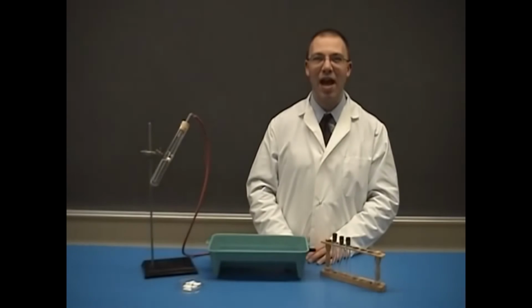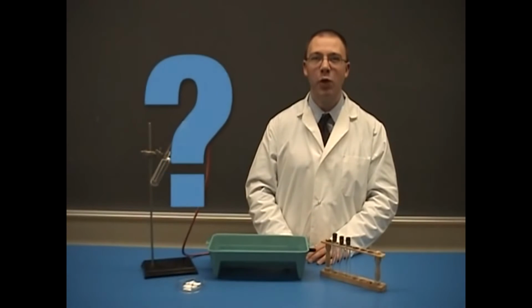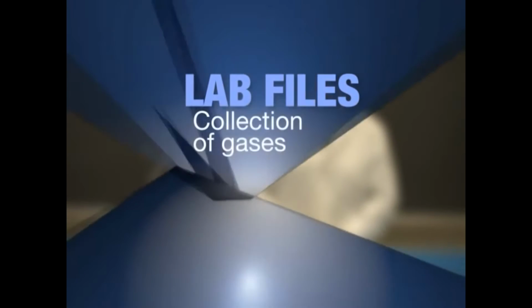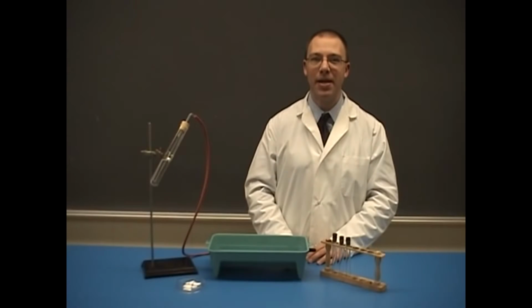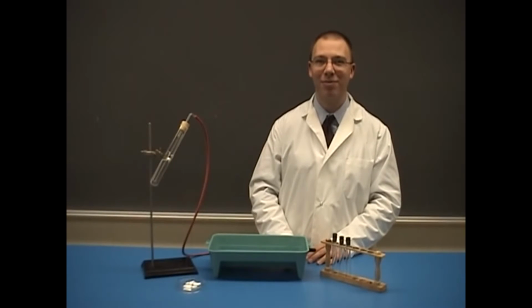How can we collect gases that we can neither see nor touch? If we could collect these gases, we could then identify them. Two gases may seem identical, but how can we collect them? And how can we test them to be sure? The objective of this lab is to collect an unknown gas, and later you can identify it.